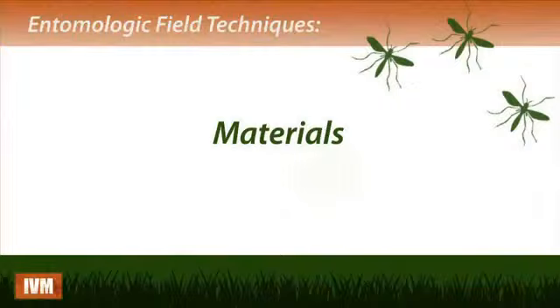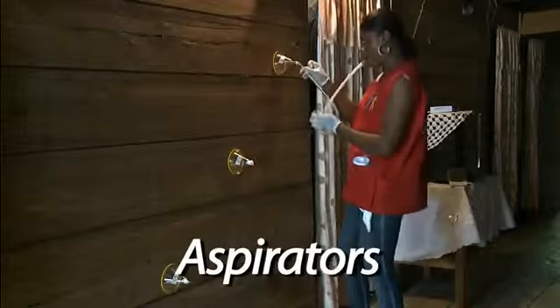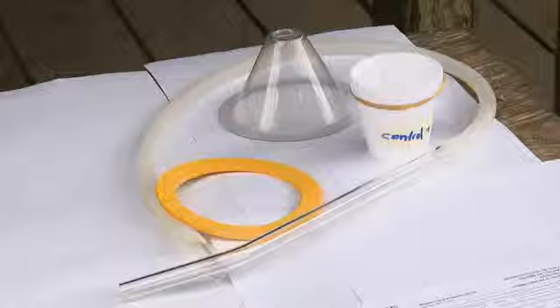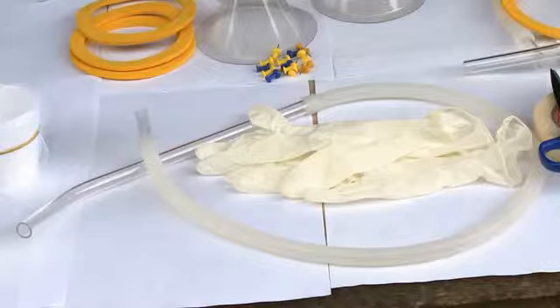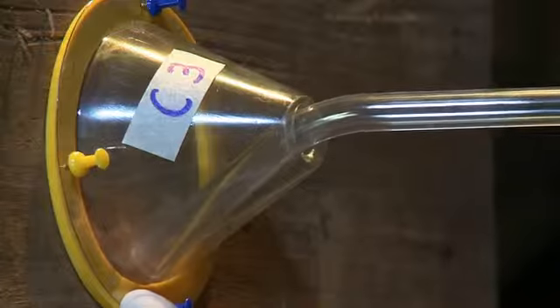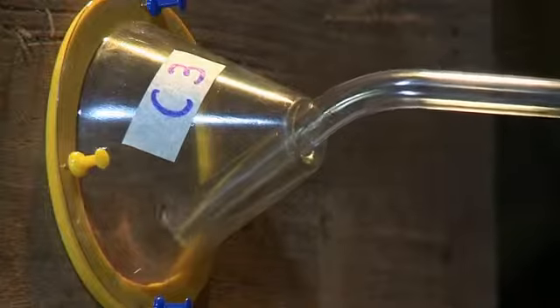In general, a bioassay kit typically contains the following equipment. Aspirators, or sucking tubes, are used for collecting mosquitoes. For this test, you will need 2 aspirators, one to transfer mosquitoes to control cones and another to transfer mosquitoes to exposed cones. A slight angle at the end of the aspirator will help in collecting mosquitoes from the edges of the cones or cups.